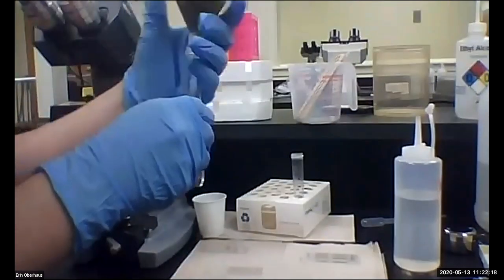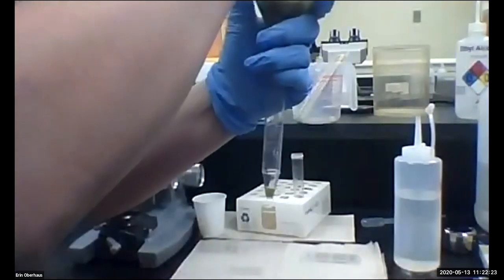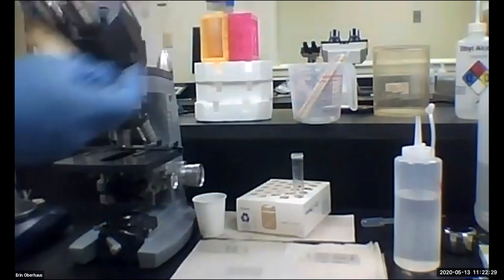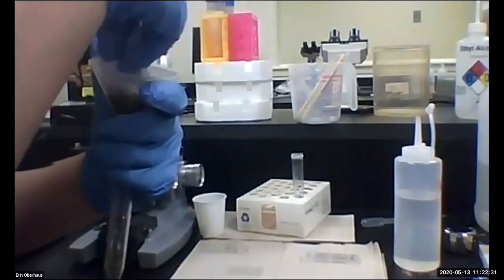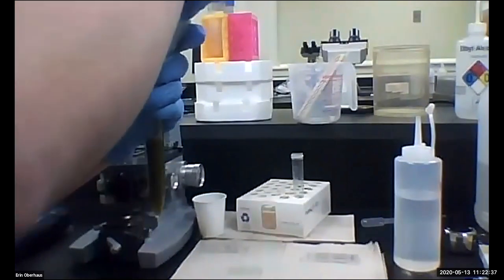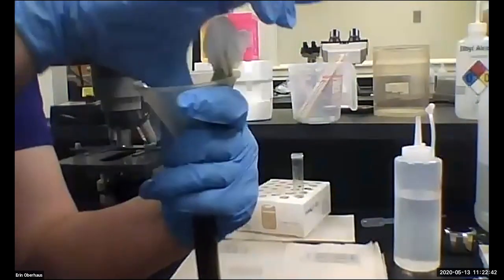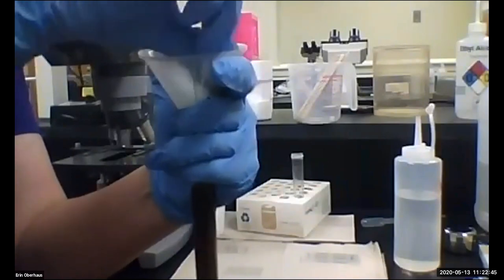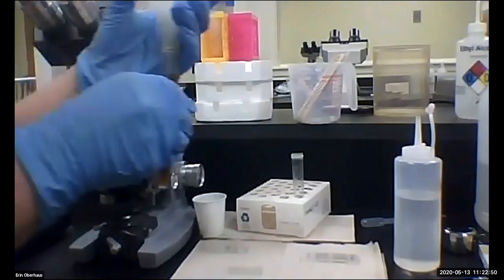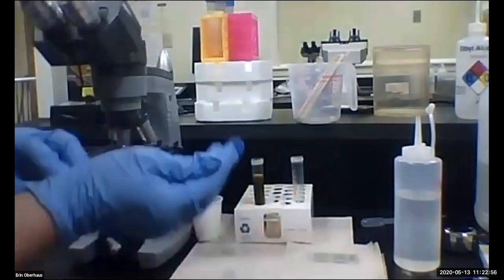So now I'm going to use my tongue depressor here to kind of filter all of this down and squeeze it down into the tube. And sometimes this is easier just by hand. So I'll let all that go down into the tube. I'm just going to use my gloved finger to kind of squeeze all the excess liquid out. I'm sorry if I'm blocking. Discard that. And then you've got what's left over there.